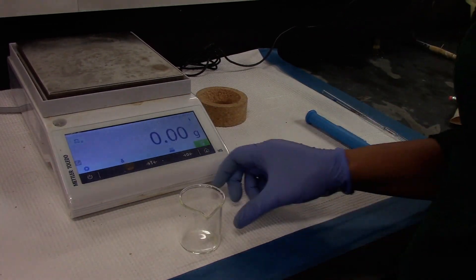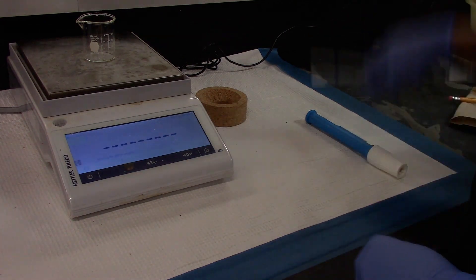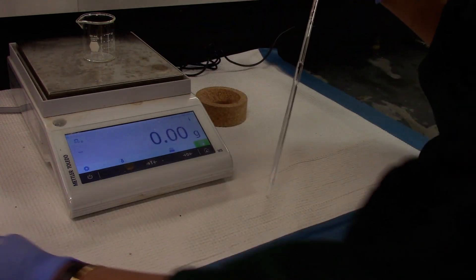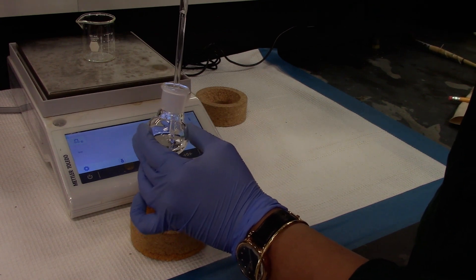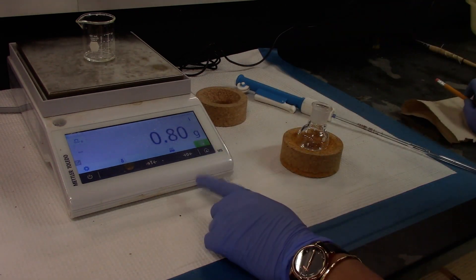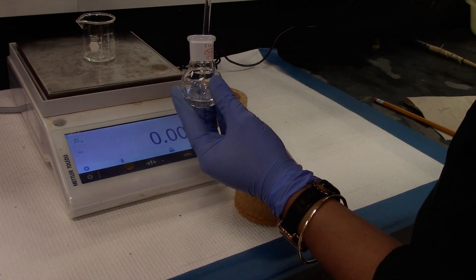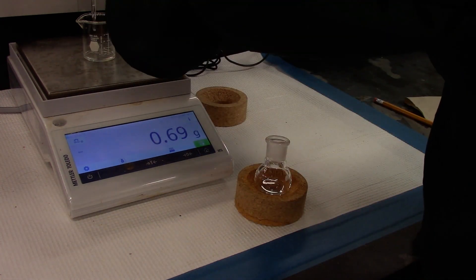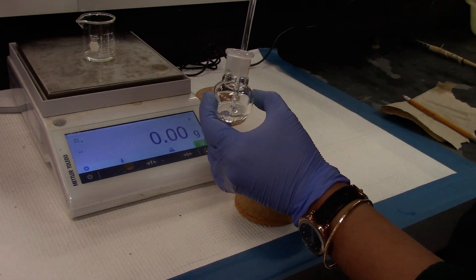We will go ahead and get the density of the distillate collected in the 25 ml round bottom flask. Using a small empty dry beaker, I will tare the mass and use a 1 ml pipette with an auto pipetter to measure exactly 1 ml and get the mass. Density is grams per milliliter — we are measuring the grams for a 1 ml solution. We will tare the mass again and add another 1 ml and record the mass. We are doing 3 trials. Then tare the balance and measure the third trial.